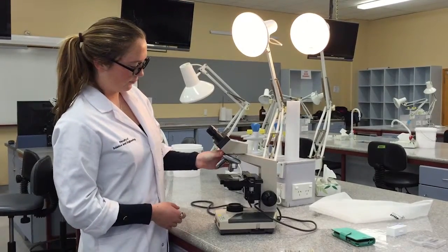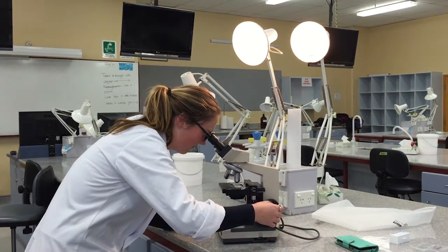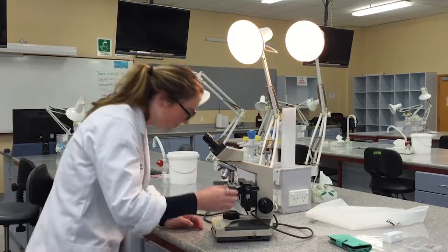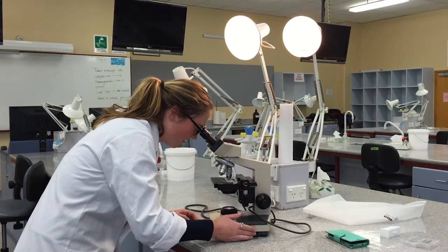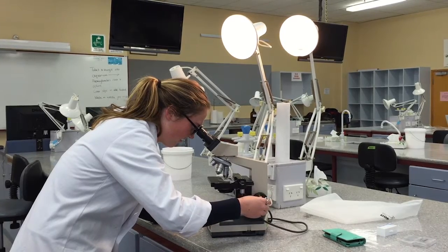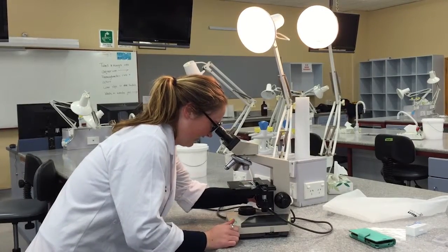A specimen on a slide is placed on the stage, held by the spring-loaded finger. Stage controls are used to place the specimen above the light source. With two eyes open and looking through the lenses, the 4x objective is selected and the large coarse focus knob is turned until the specimen is in focus. The smaller fine focus knob is then turned to get perfect focus.